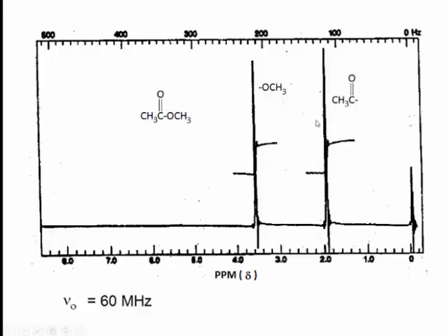Now, since both peak areas are going to be the same, they're each due to a methyl group, the height of the stair-step lines, as you can see, are approximately the same. So we can use peak integration to determine the relative areas of signal peaks, which will tell us the relative number of protons associated with each peak signal.